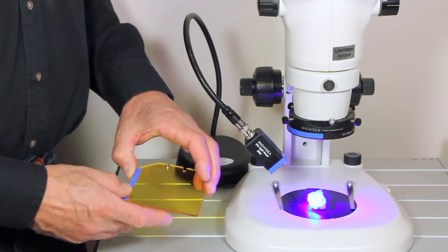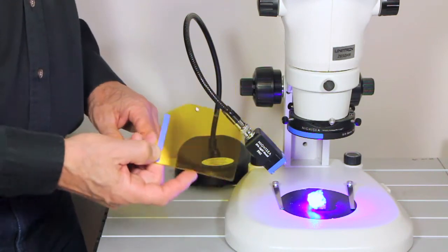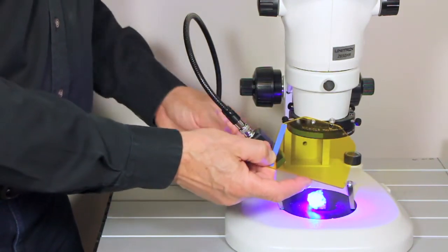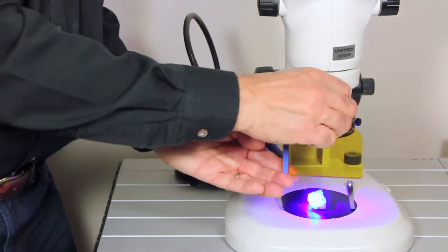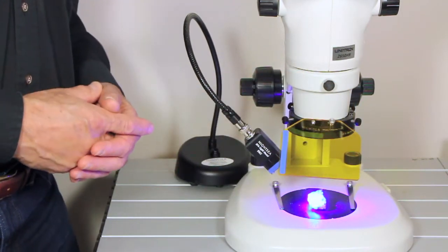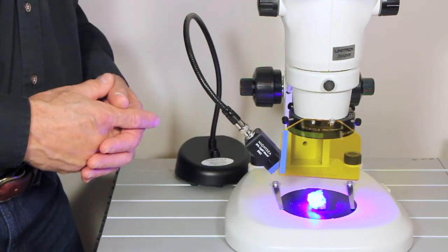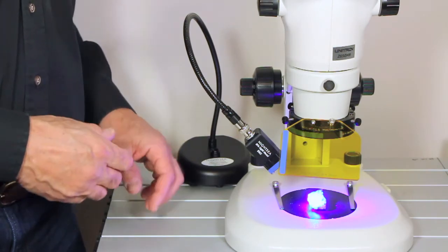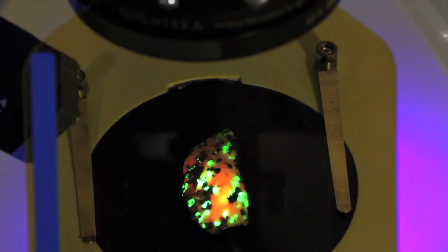You don't want to work with bright light in your face. So we have a viewing shield that just pivots into place. And that's not only protection against the reflected excitation light, that's also a filter itself. So if you look through it, you can see the fluorescence.